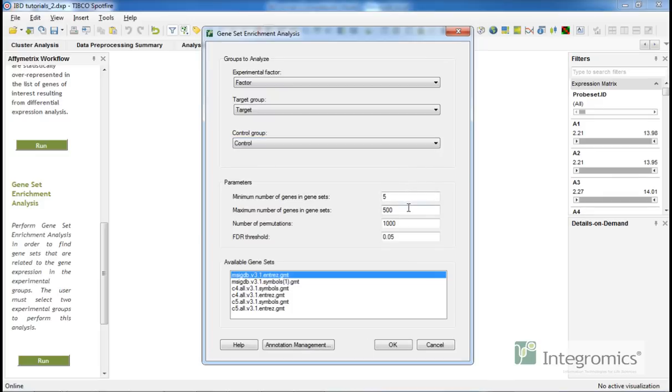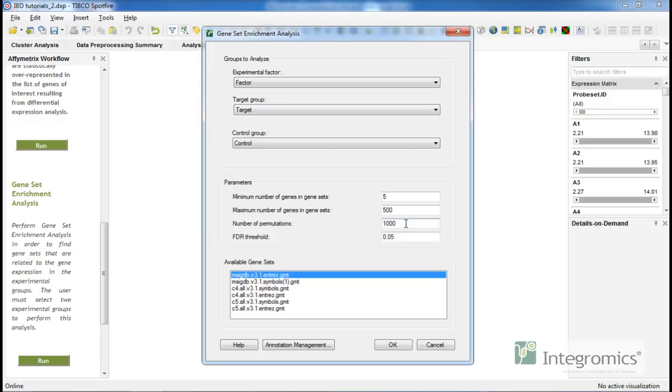Permutations are used to calculate the enrichment p-value. The smallest possible non-zero p-value is defined as 1 over number of permutations. Higher values will allow for smaller p-values, but please be aware that the calculation can take more time.